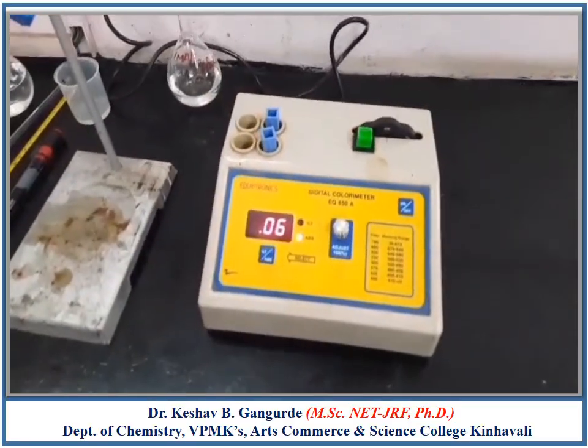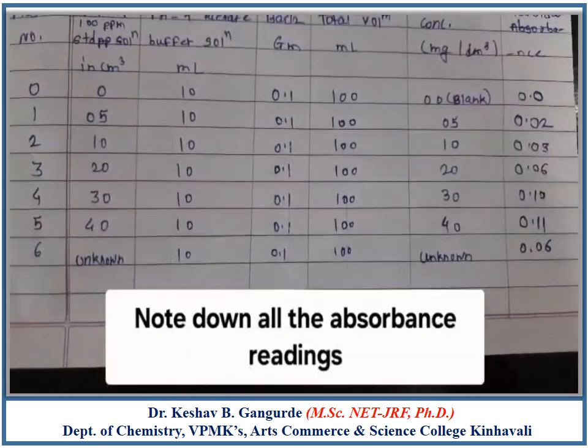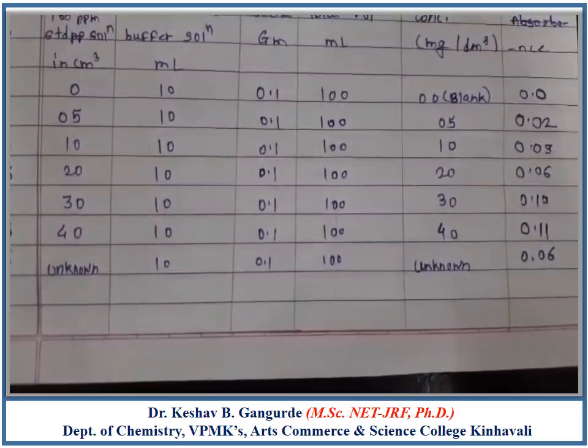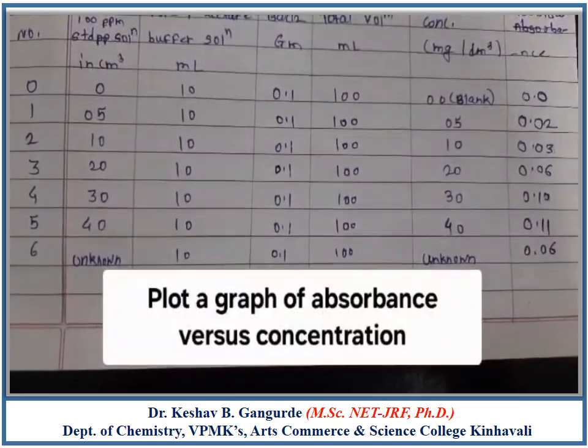Measure the absorbance of the unknown solution using the colorimeter at 420 nm. The absorbance of the unknown sample solution is 0.06 units. Note down all absorbance readings in the observation table and plot a graph of absorbance versus concentration of sulphate ion in ppm.